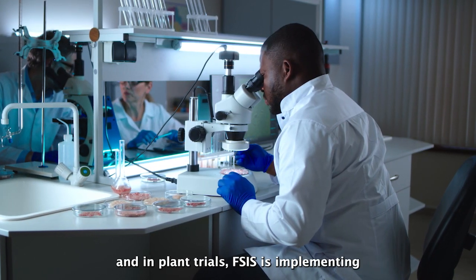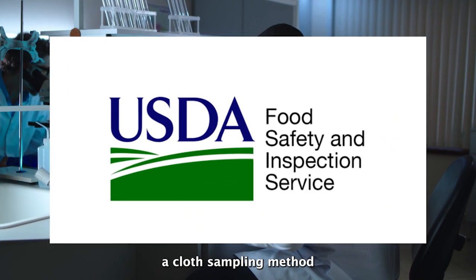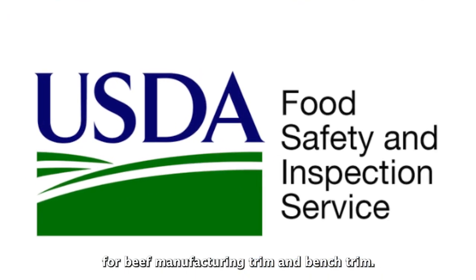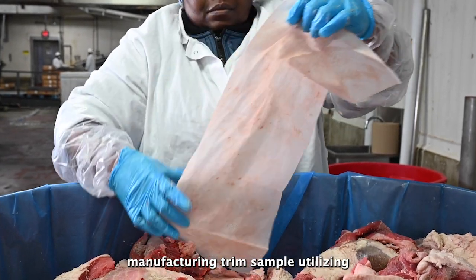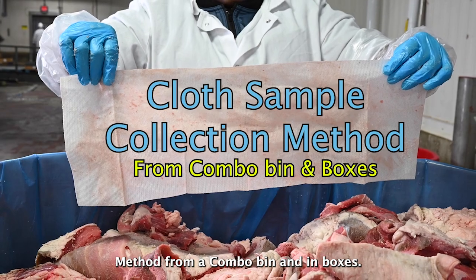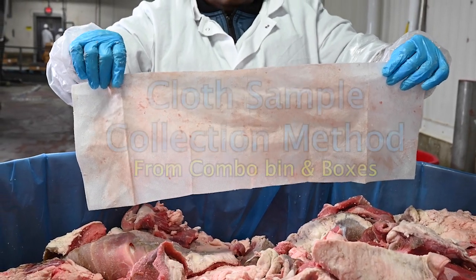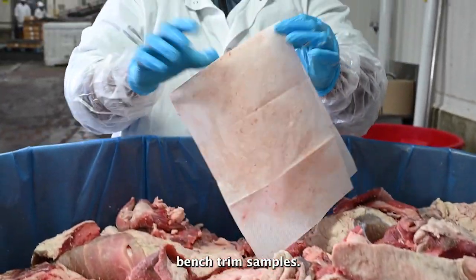After years of research and in-plant trials, FSIS is implementing a cloth sampling method for beef manufacturing trim and bench trim. Today we're going to collect a beef manufacturing trimming sample utilizing the cloth sample collection method from a combo bin and in boxes. This same method will be used to collect bench trim samples.